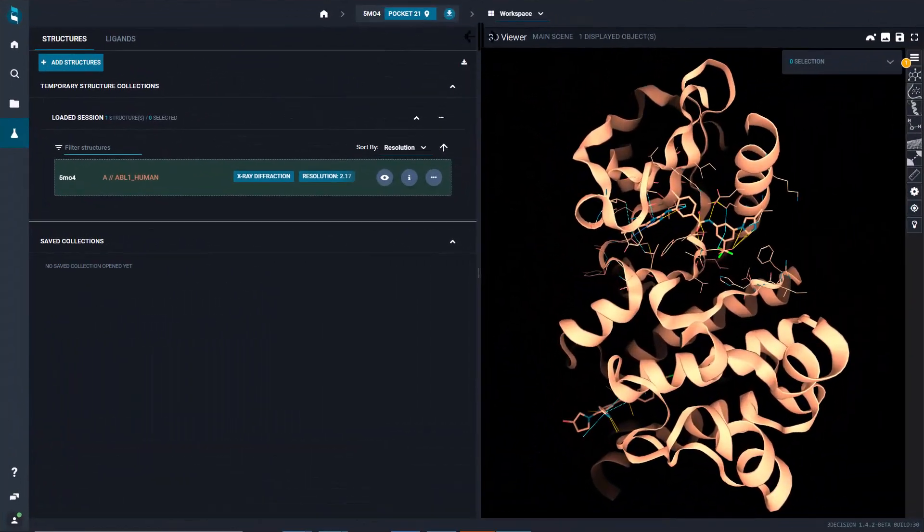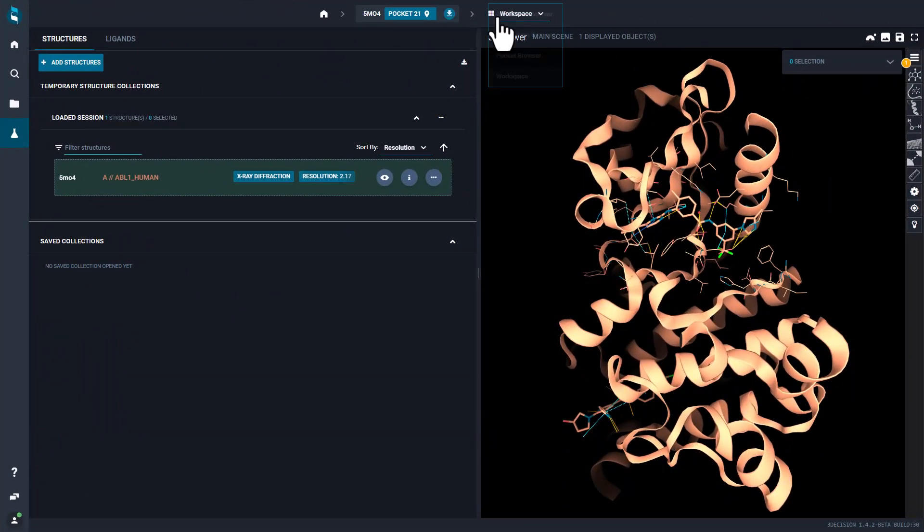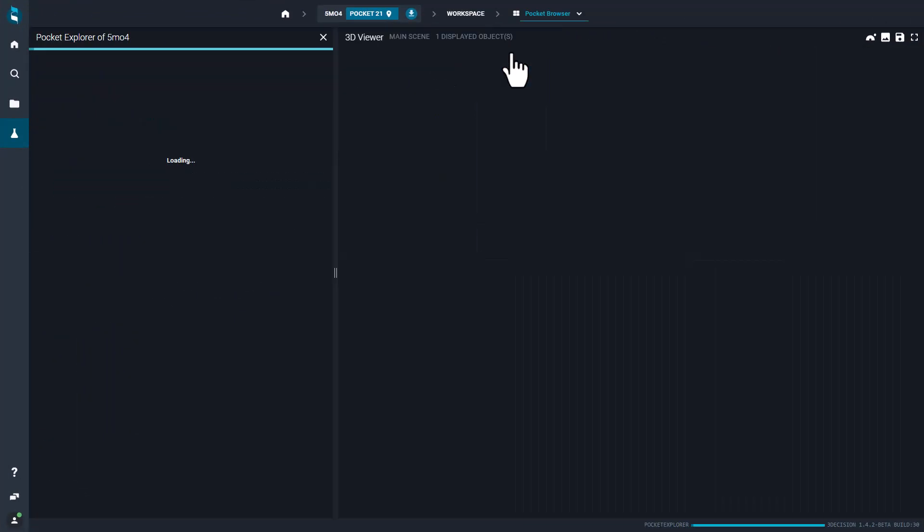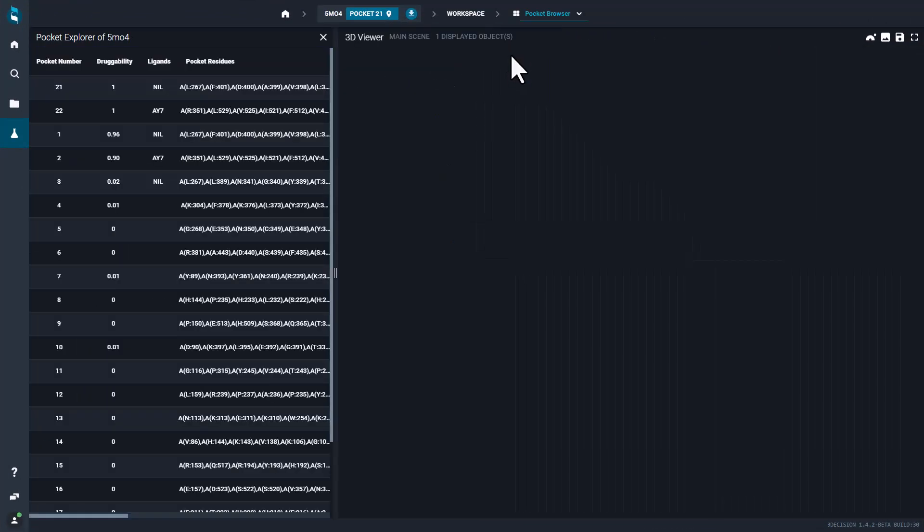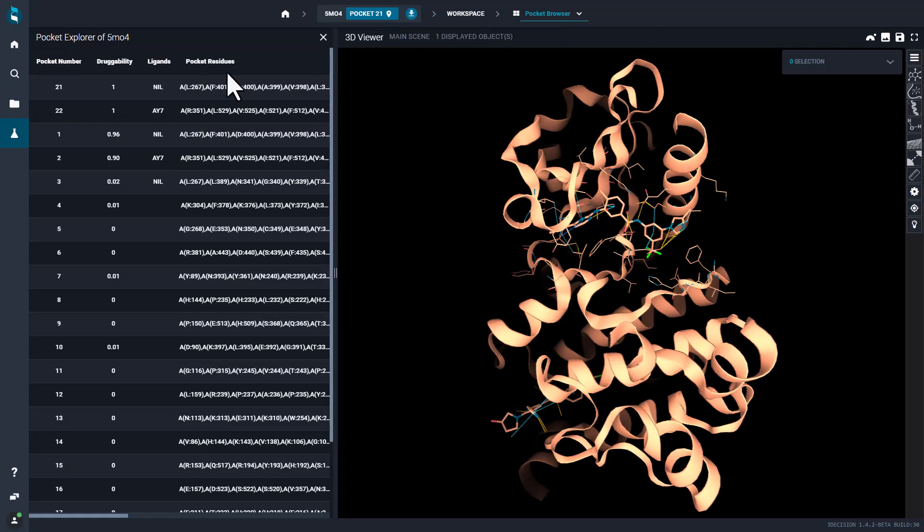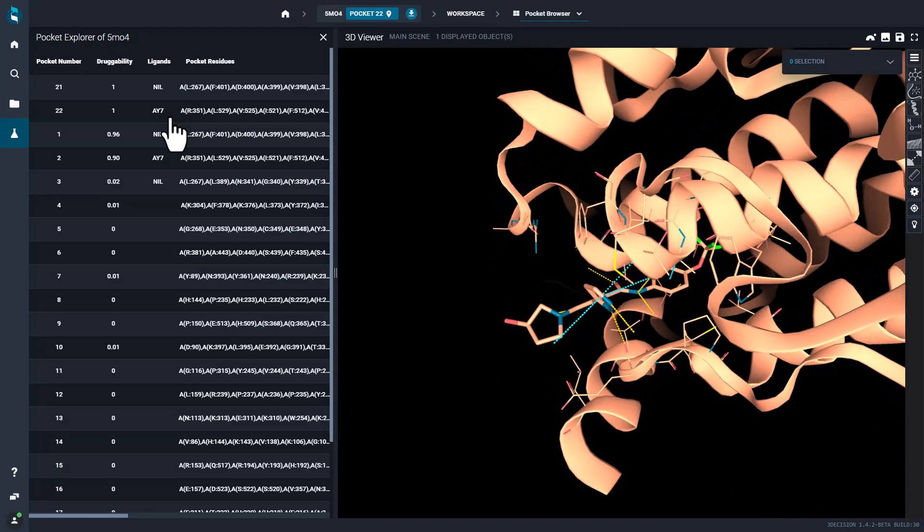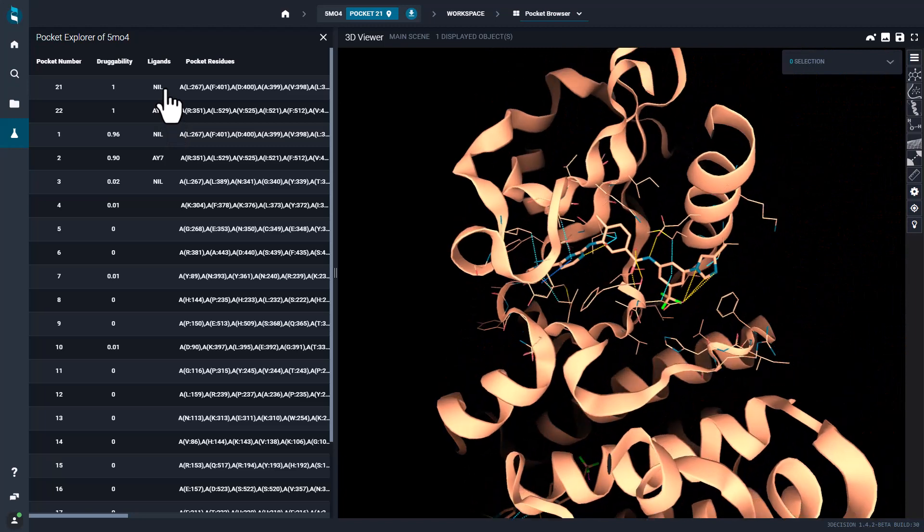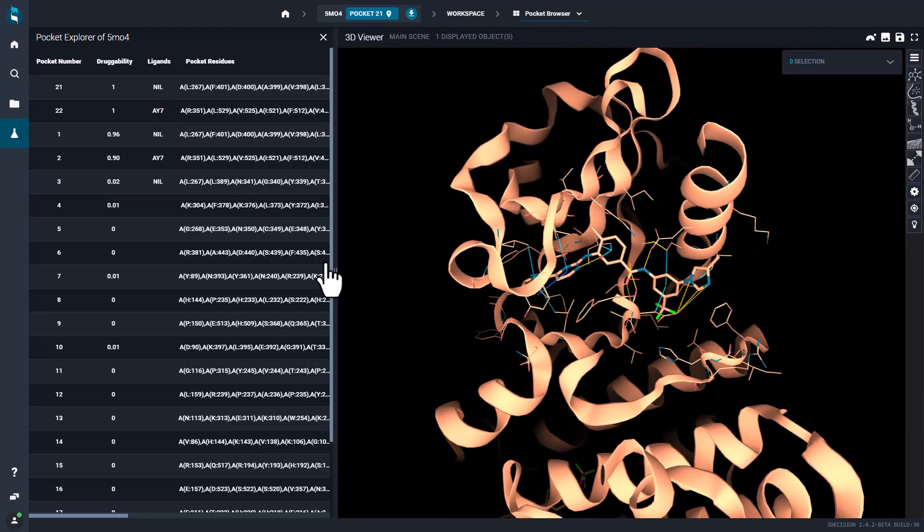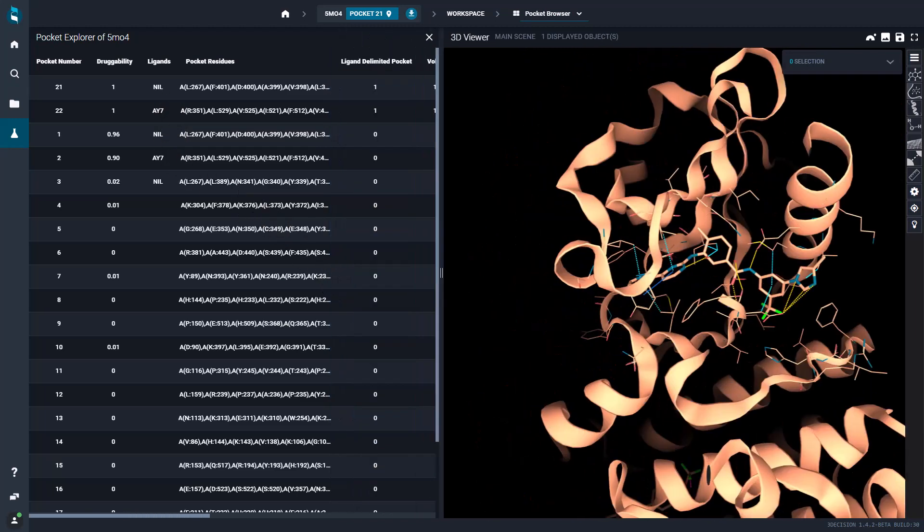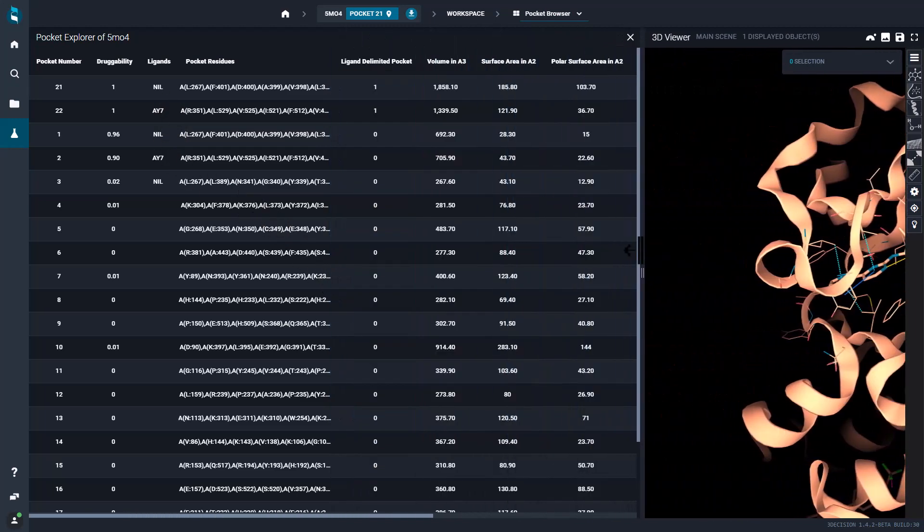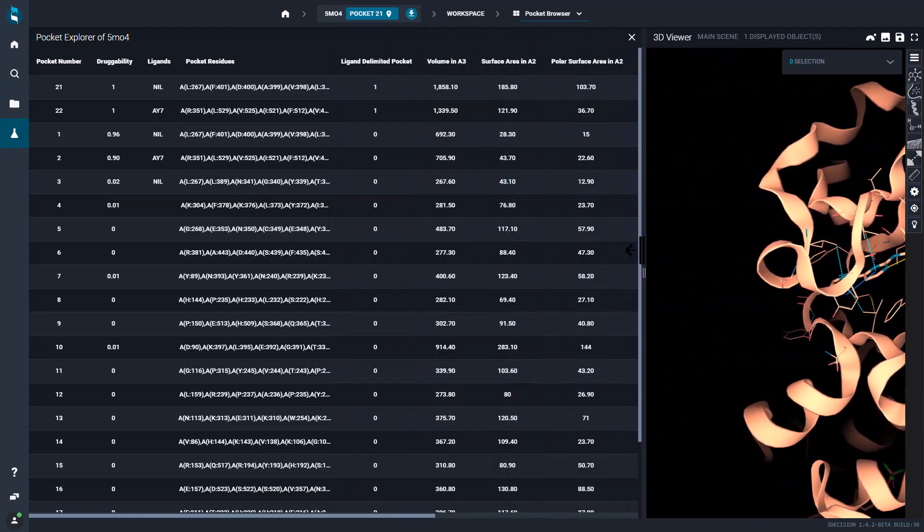For instance, upon registration each structure is processed to detect all putative and known binding sites on the protein surface. You can quickly inspect allosteric and orthosteric pockets and get information on pocket properties like drugability and volume.